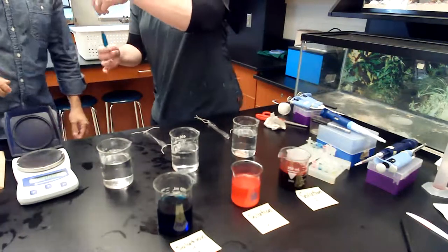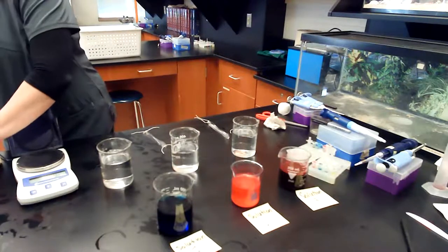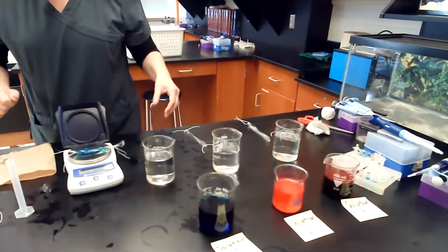All right. So we're going to weigh it first. Let's just get rid of it and dry it first. And then see, because I feel like that's pointing that way. Okay, because then you need to write that down.